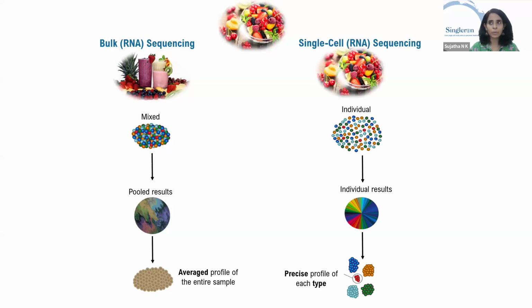So you take a fruit bowl, but this time you're individually assessing every piece in it. Your results correlate to each piece you took out, and so you have precise profiles. This is very useful and important.